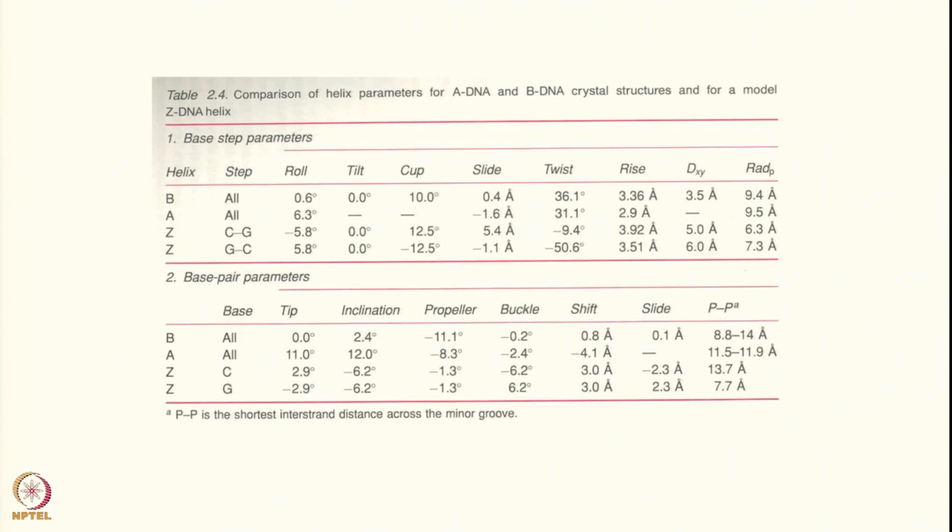So, in other words, we need to characterize this kind of detail for the structure when we want to calculate the structures of the molecules, and crystallography has been used and NMR also has been used, and we will see more of what kind of structures have been determined by the NMR data, and these happen in the solution. Okay. So, this has become possible with various kinds of NMR experiments and certain algorithms which have been developed. So, I think we can stop here.